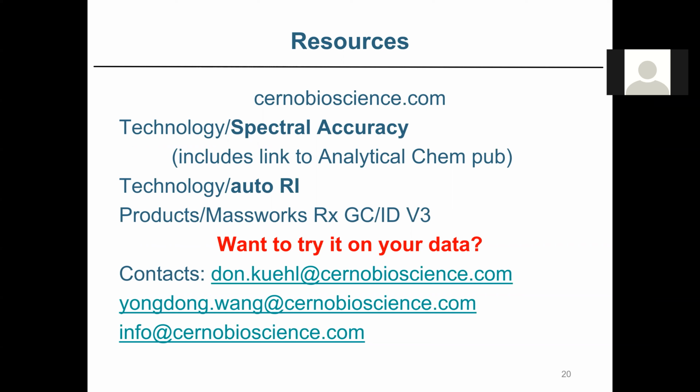The first question is that in the parameter setup in GCID, we use some notations for the column types, in terms of polar, semi-polar, and so on. How does that correspond to some other notations like DB1, DB5?